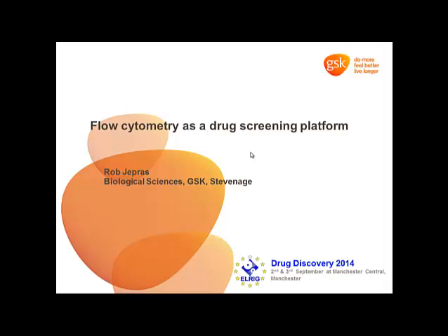However, it hasn't had the same impact in drug screening, particularly if you compare it with its sister, high-content imaging. But what I want to show over the next 20 minutes or so is how that's changing and some of the dynamics that are highlighting flow cytometry as a really good drug screening platform.